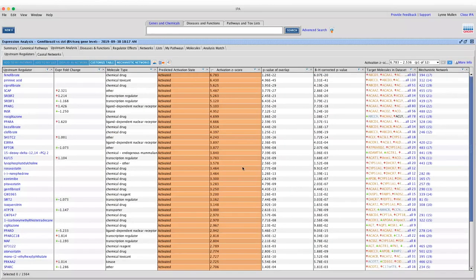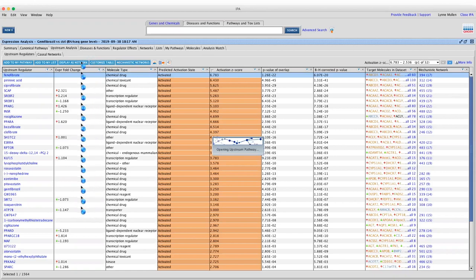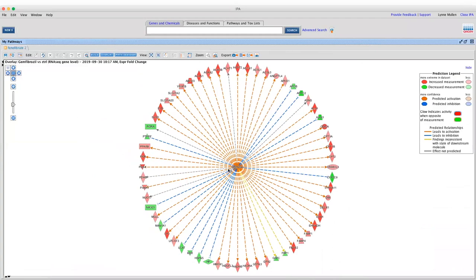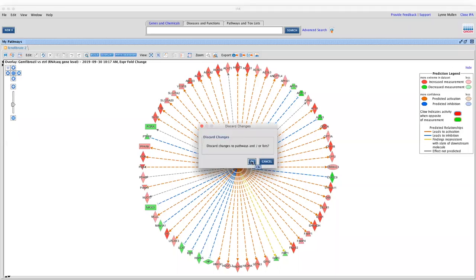If you want to view this visually, select the upstream regulator and click Display as Network. This shows a visual diagram with the upstream regulator in the center and all the targets outside. There's a prediction legend explaining the different colorings of the lines and more.